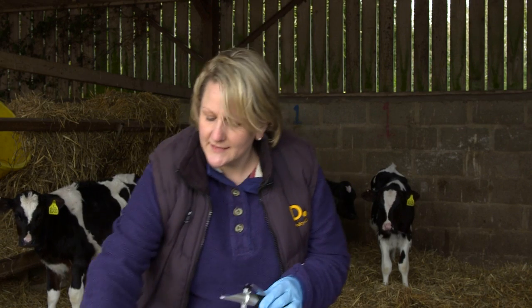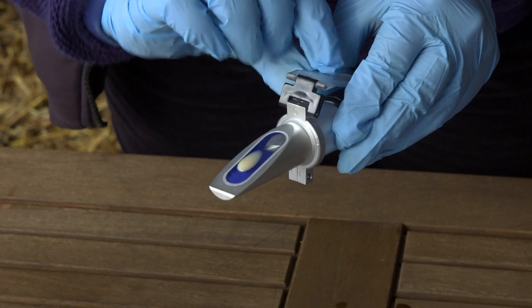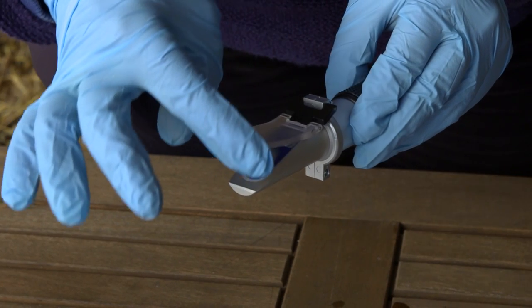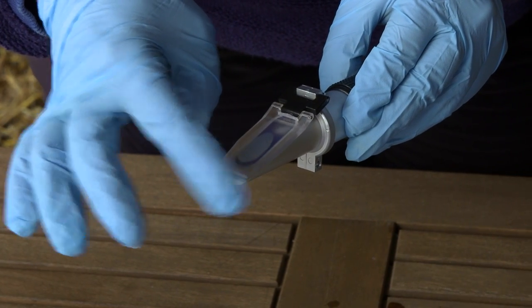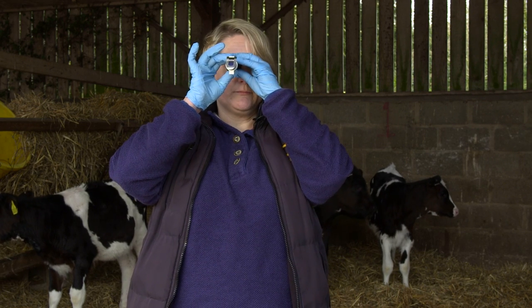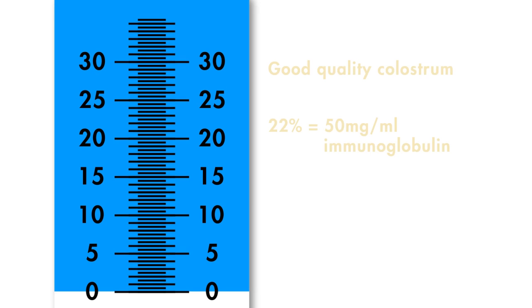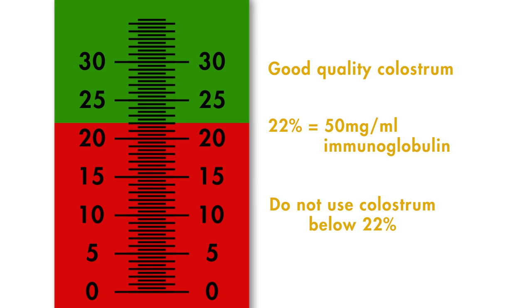Once dry, take two or three drops of colostrum, placing them on the glass surface, carefully lowering the cover to make sure there are no dry areas or air bubbles. Then take the reading as before. The cutoff value for high-quality colostrum is 22%, which represents 50 milligram per milliliter of immunoglobulin. If the reading is less than this, the colostrum shouldn't be used.